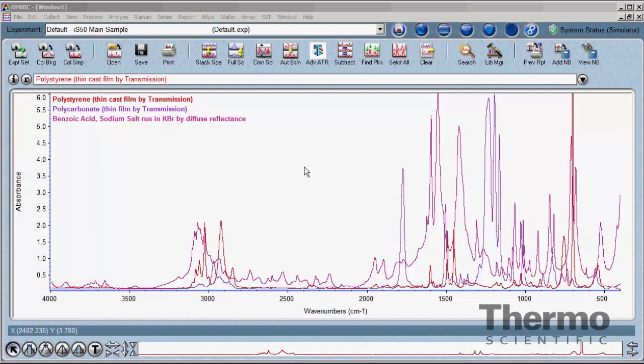The Thermo Scientific OMNIC software controls the FTIR and Raman products they offer. It is a full-featured package containing a variety of functions and processes to collect, view, manipulate, and analyze spectral data. OMNIC should be thought of as a tool chest containing all the tools needed to work with spectral data. Some tools will be used regularly while others only in specific analytical situations. Becoming familiar with the tools available and how they can be applied to reach the desired goal is the first step.